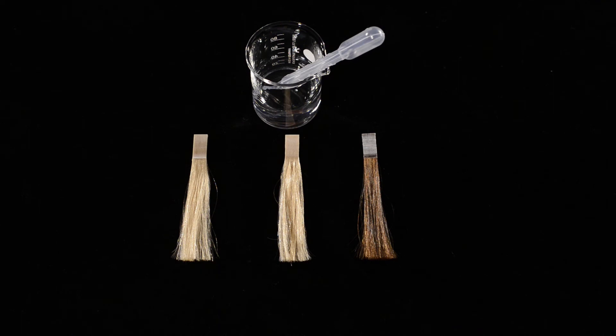In this experiment I want to show you a very simple way to analyze the quality of the hair surface. On the right side you see a natural undamaged hair strand. Its surface is covered by a thin natural protection layer that rejects water.